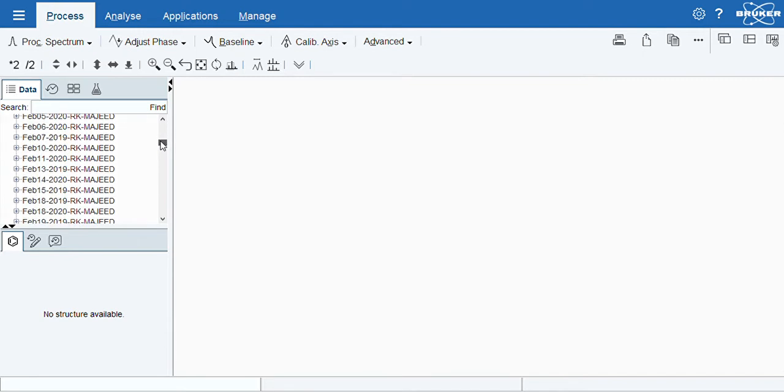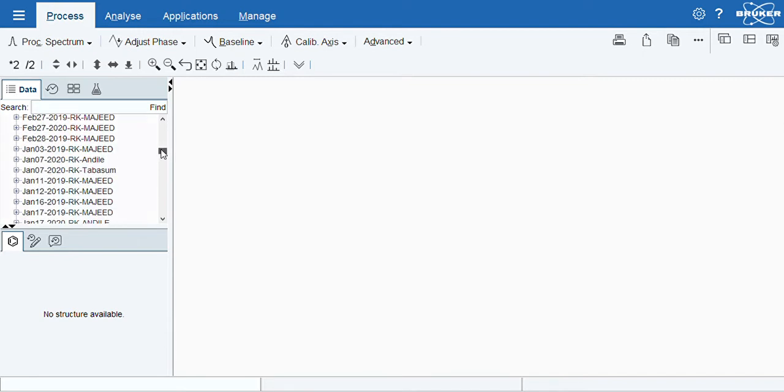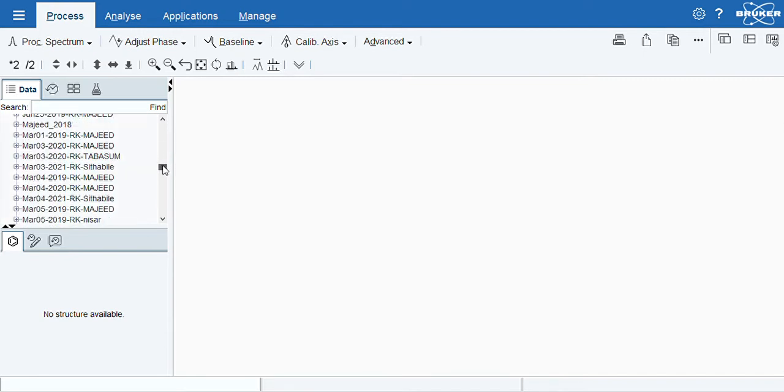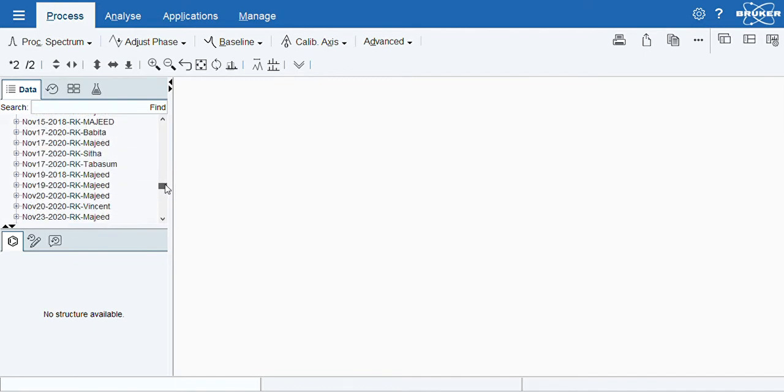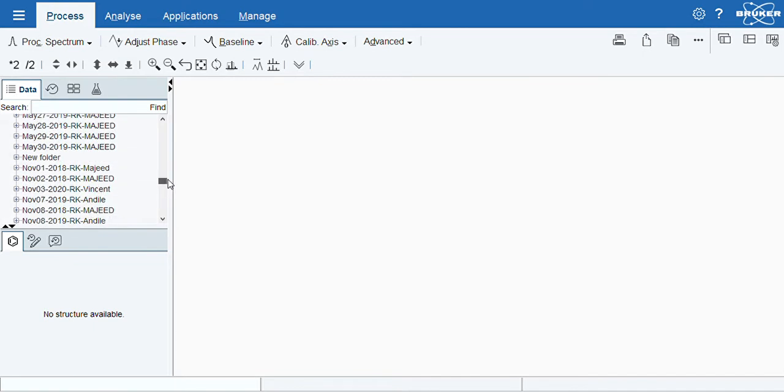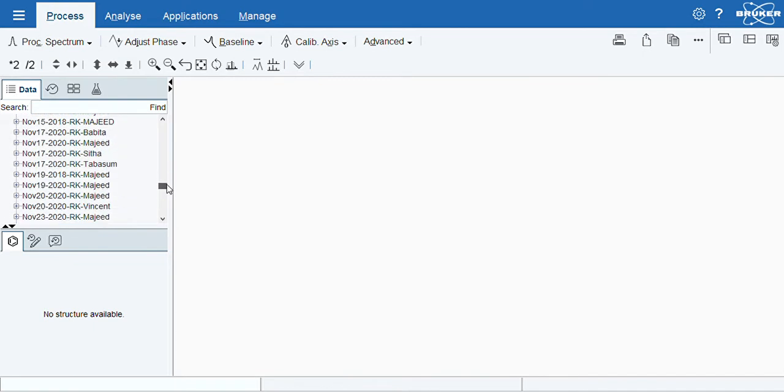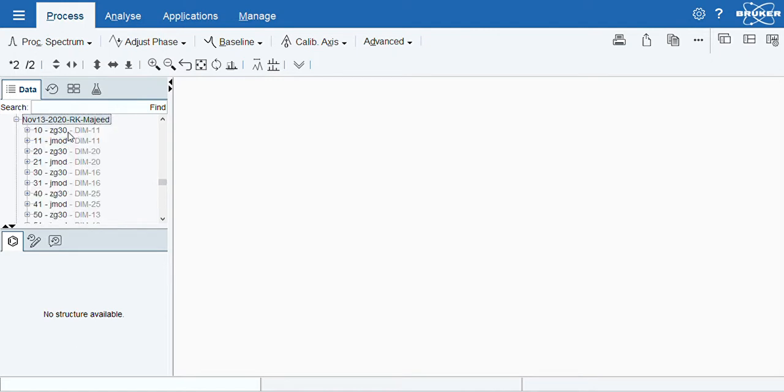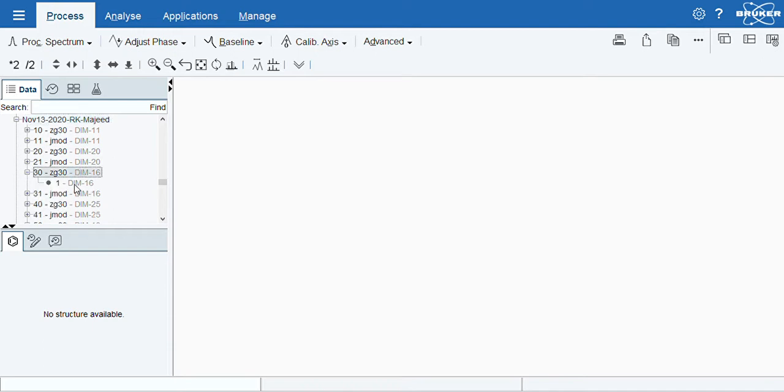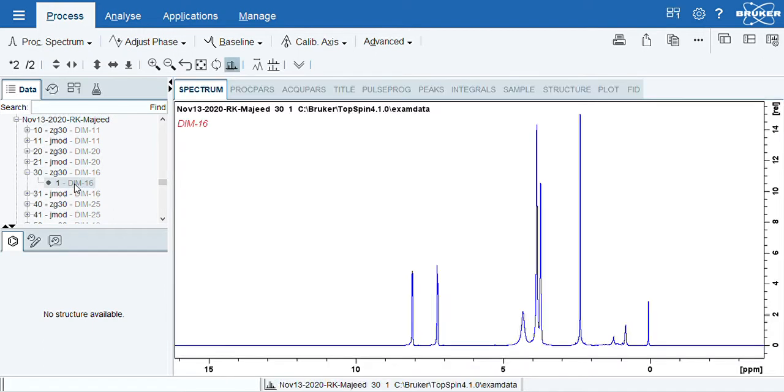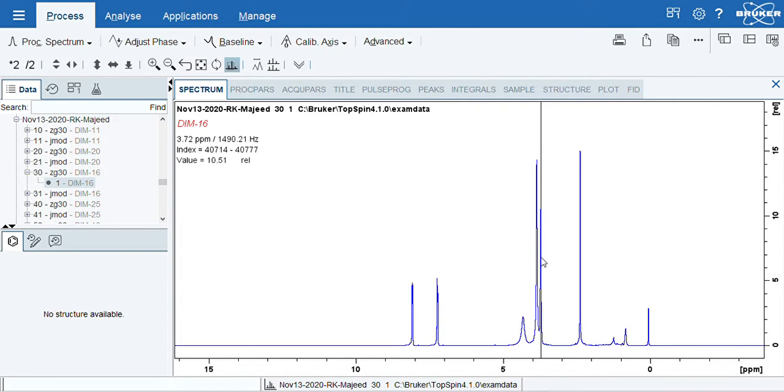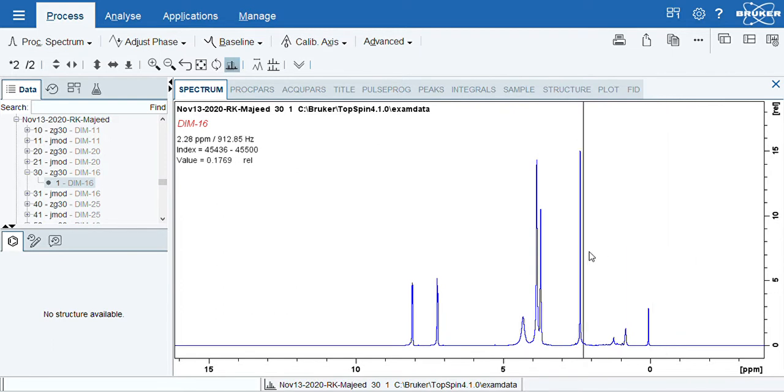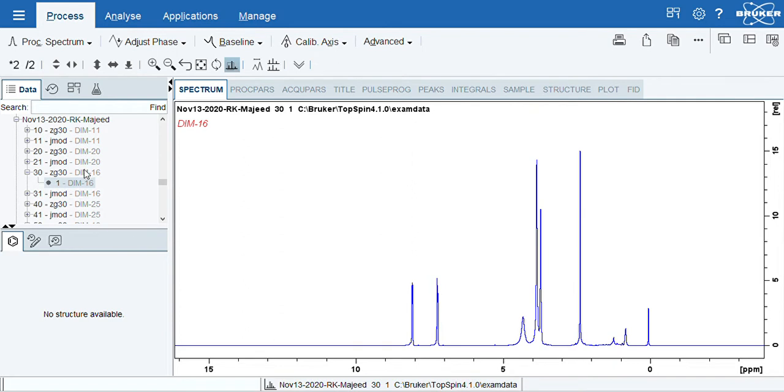For example, I have a target folder of number 13 in which I have a molecule. Just for an example, I have a DIM16. I will click it, then click it and it opens up. It opens up this way.